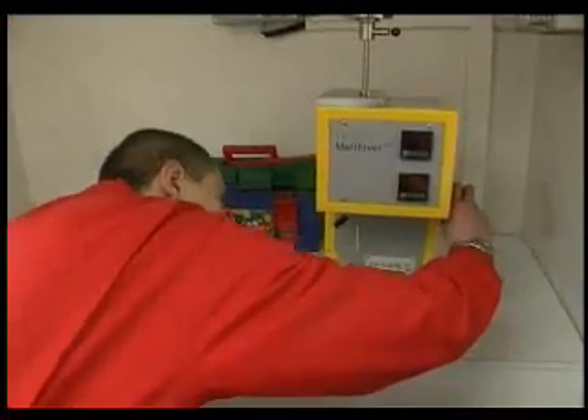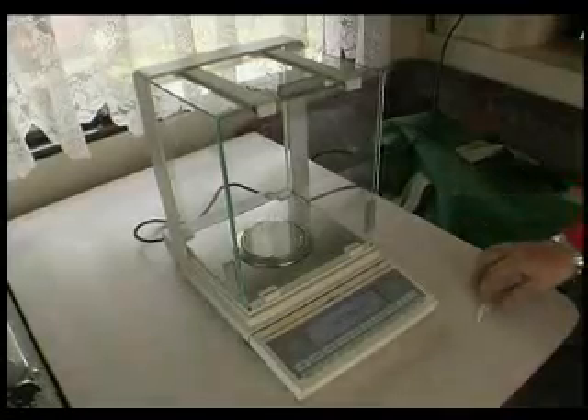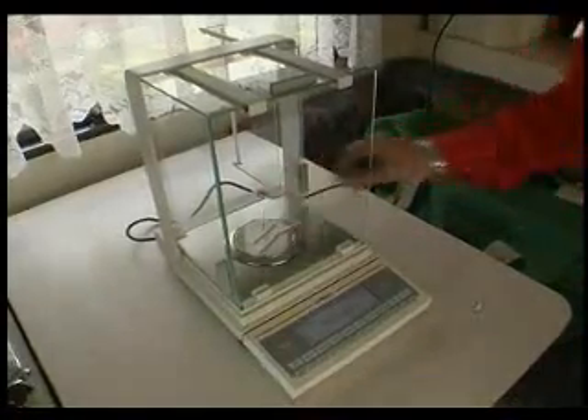The test strand is cut off after the given time has been reached and placed on an analytical scale to be weighed. This is how the exact MFI value is measured.